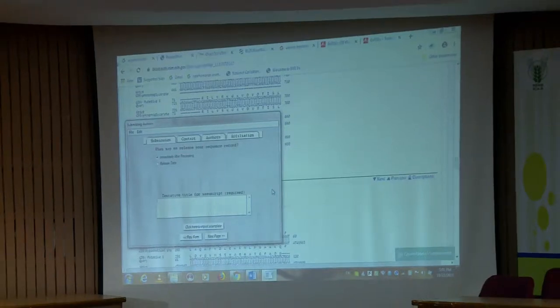If everything is correct as per their instructions, then within 1 week you will get your GenBank accession numbers. Otherwise, if you made any mistake at the nucleotide level, even if you missed out one nucleotide, you will keep on struggling for months and months to get your accession number, because they will keep on sending it back asking you to annotate it again, check it again. So the curation part in the beginning, please do it correctly.